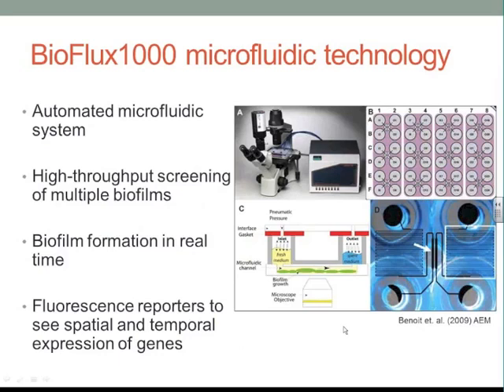So over here, just a brief description of it: everybody knows that you can automate this system, so it allows you to take images over an extended period of time, and then you can stack these images and allow these to become movies, which is really nice because I always say this, and I think it's true, it's a cliche thing, but a picture's worth 1,000 words. A video that's composed of 200 images is most likely worth 200,000 words. And I think that's true when you really get to pick apart these biofilms.